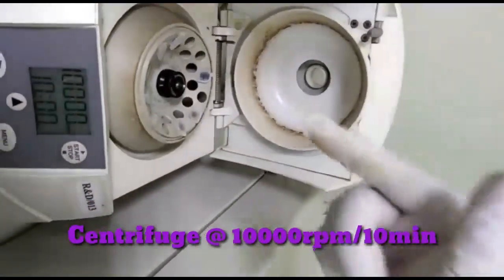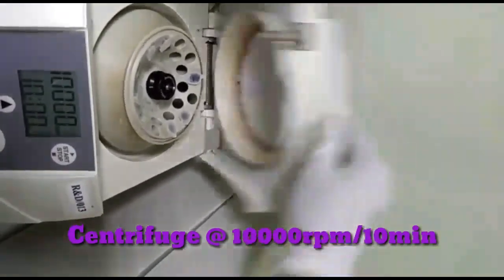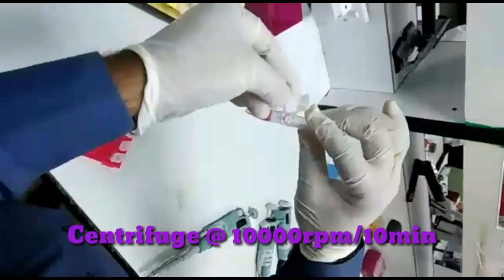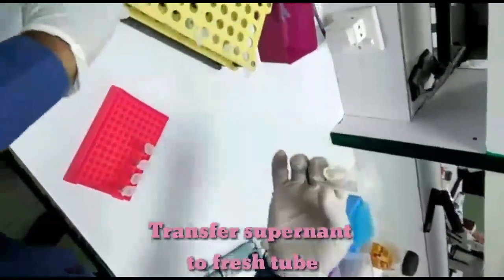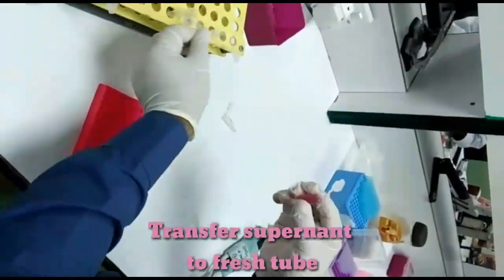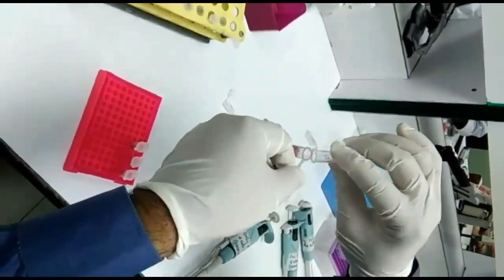Centrifuge at 10,000 rpm for 10 minutes. After centrifuge, transfer the supernatant in a fresh new sterilized tube.